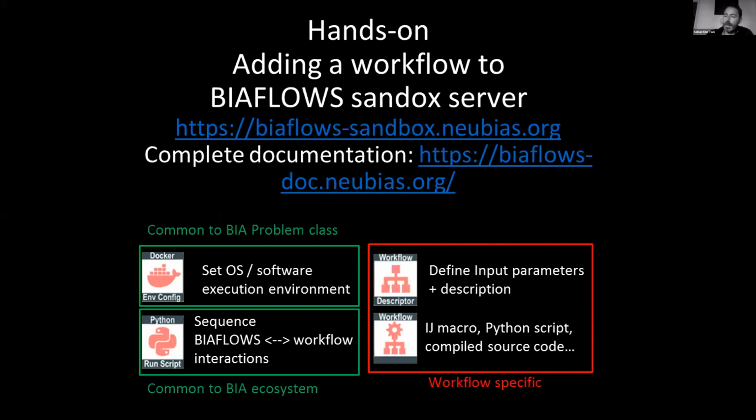So to make it simpler and also split, let's say, the difficulties or challenges in doing so, we will work with simple images so that the image analysis part is not the main issue here. And I will also impose you, so to say, to work on an ImageJ macro. Not something else.